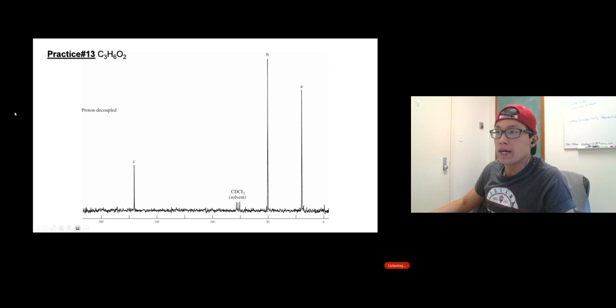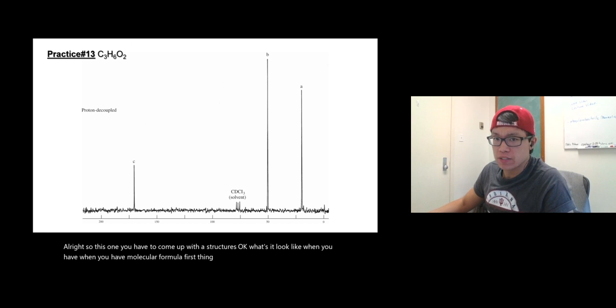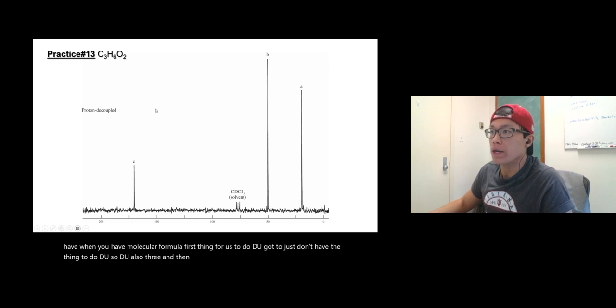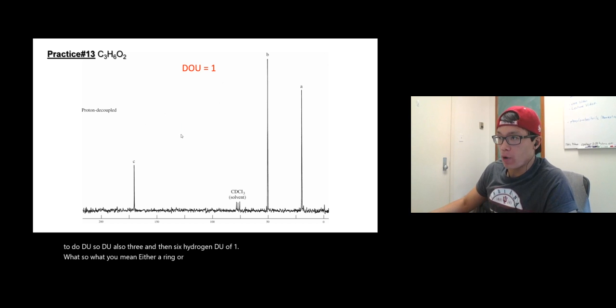All right, so this one you have to come up with the structures. Okay, what's it look like? When you have a molecular formula, first thing first, do DOU. Just don't have to think, just do DOU. So DOU, so 3 carbons and 6 hydrogens, DOU of 1. All right, so which means either a ring or a double bond.